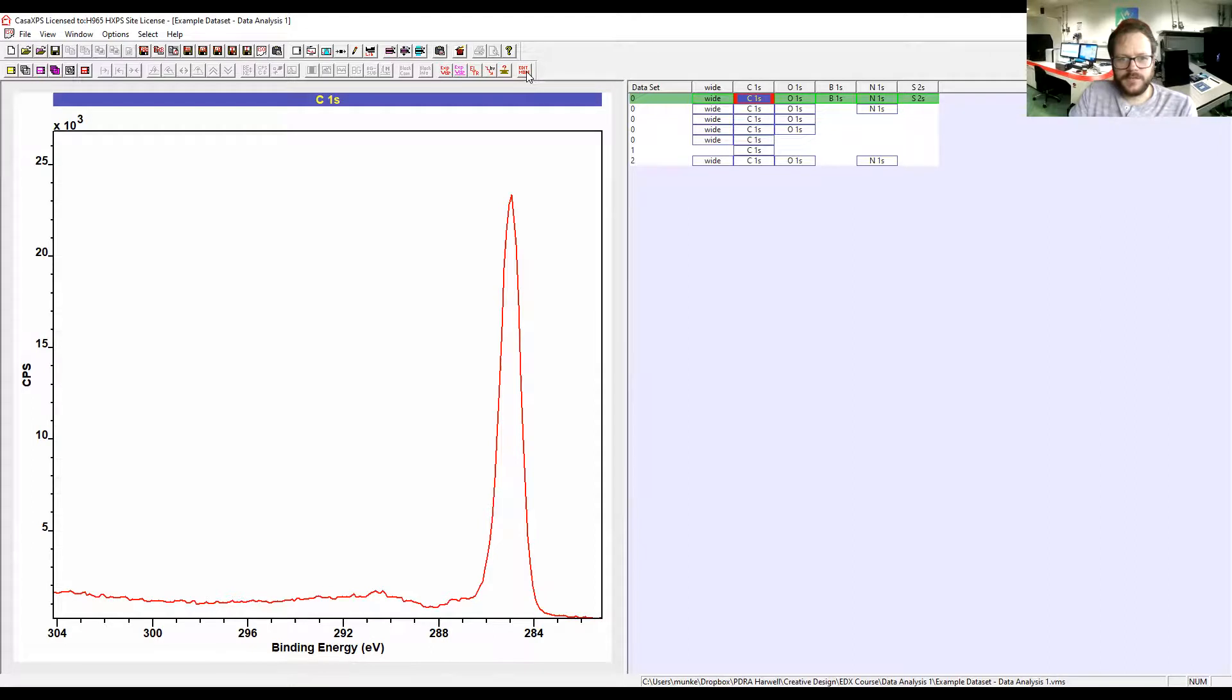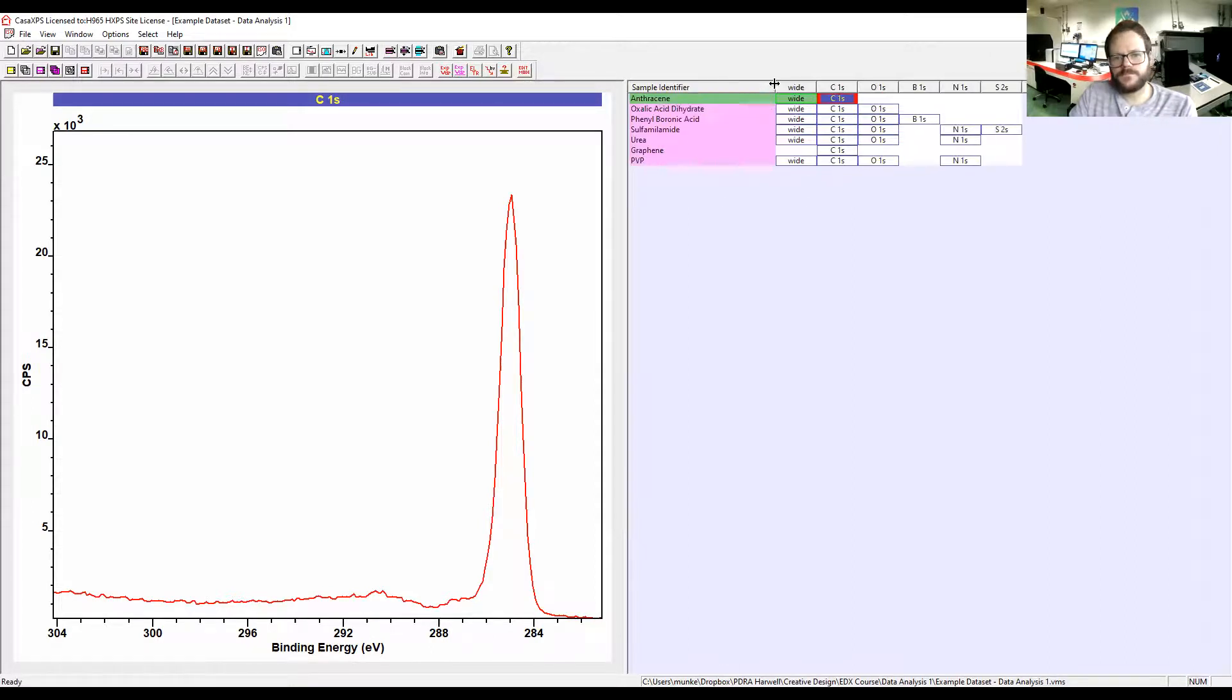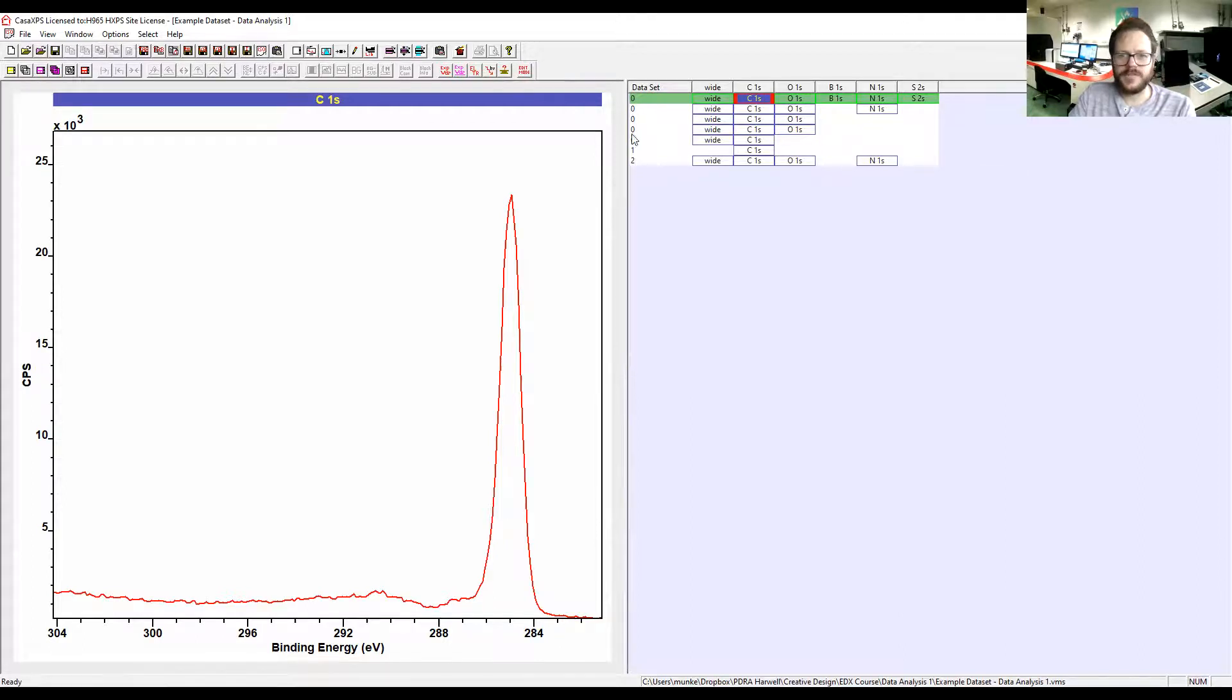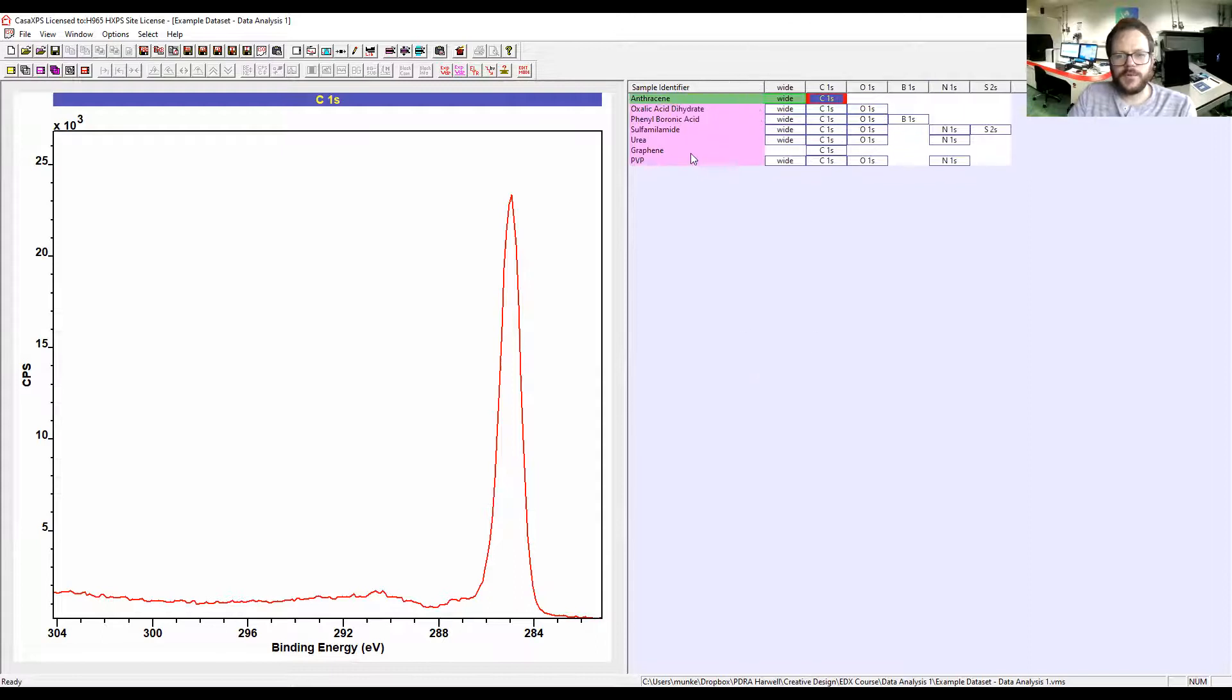Finally, I just want to mention something called Edit Mode. If we toggle this, we can then bring up our sample identifiers. By default, Casa will usually be set onto this mode. If you just click Edit Mode, that will bring up all of your sample names.